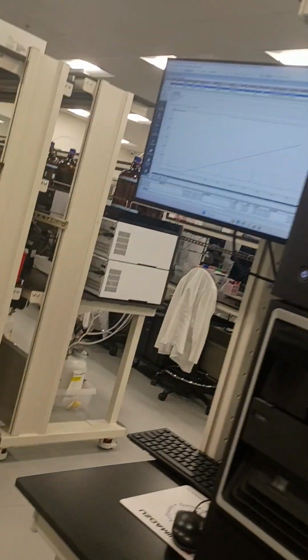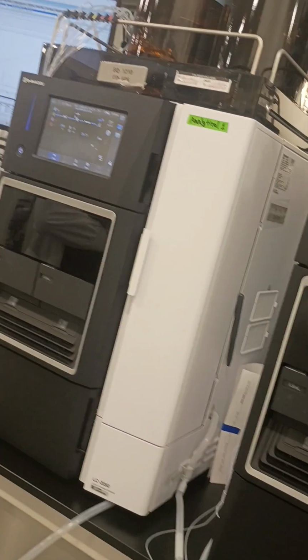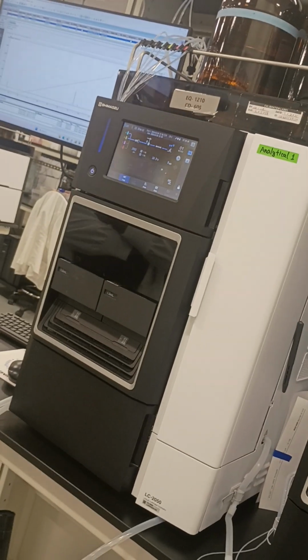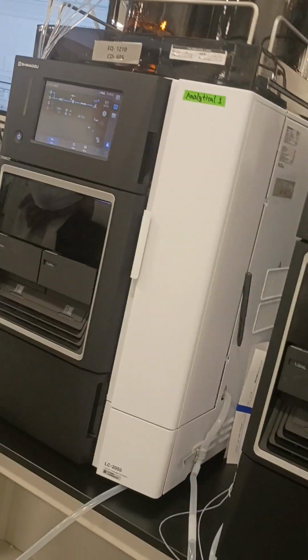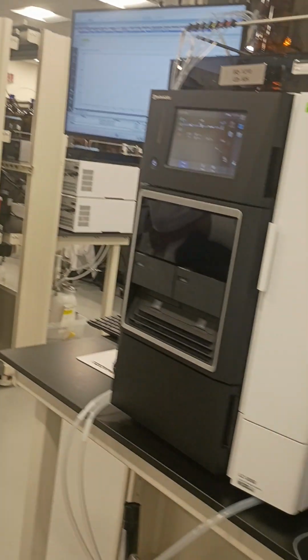So this is the analytical. Report that? Yes, report that. We don't really know who forgot to do it, but you can always report it, like on QuickBase, as I showed you guys. You have to report that this machine wasn't properly shut down. We already set you guys up. That sheet that he made is on there too. We'll go to QuickBase real quick.